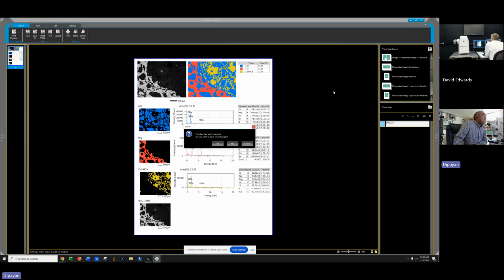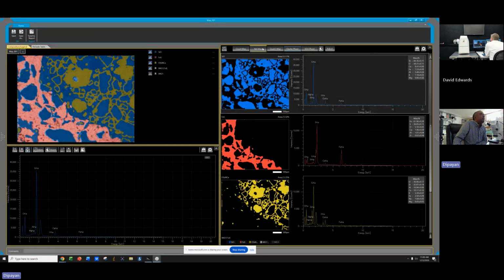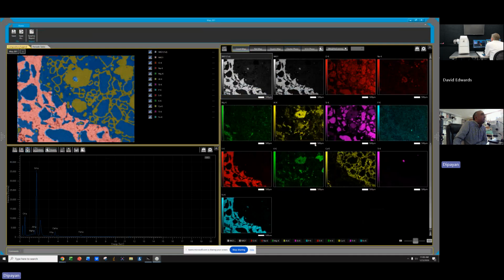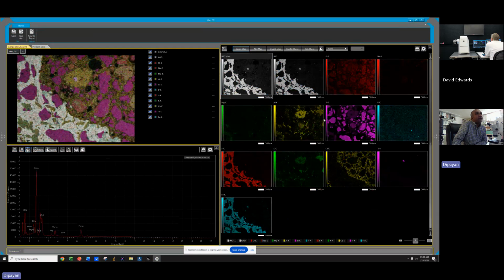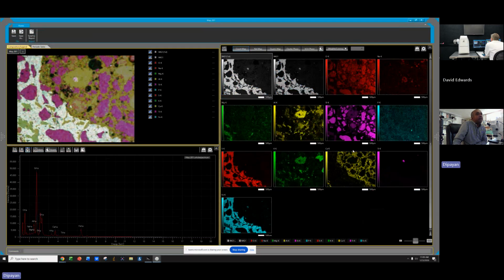And if I do it in a map form, where is my map? Let's go to my count map. In the count map, let's talk about this. This is where I usually go to none, and none gives me the sharpest image. So if you want to stay weighted average, see it's getting blurry. You see how it got blurry?